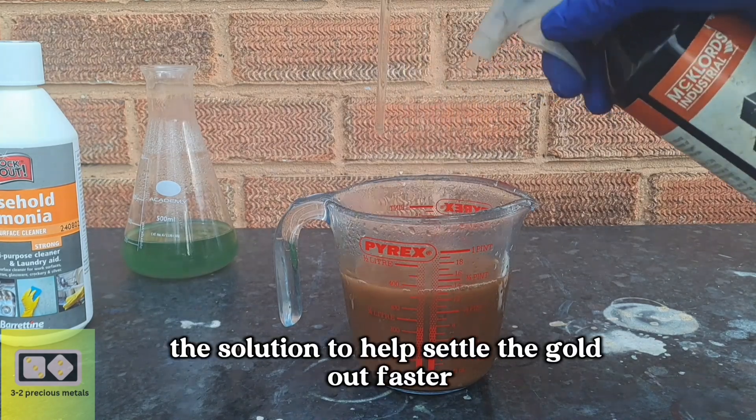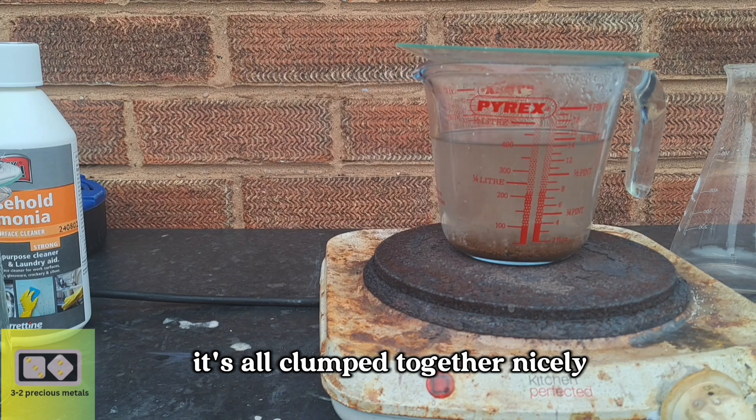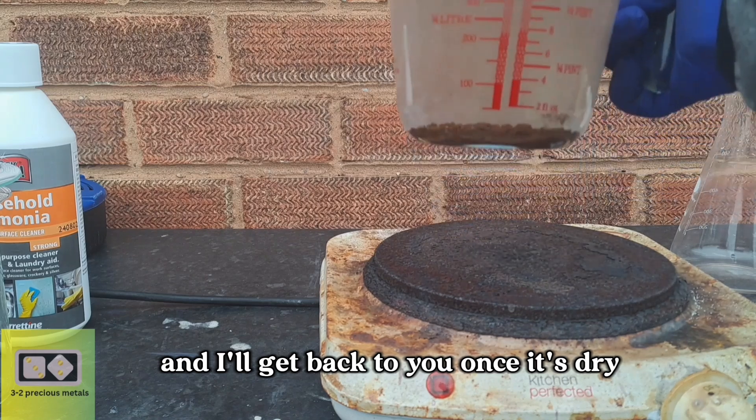I'll boil the solution to help settle the gold out faster. The gold is looking beautiful — it's all clumped together nicely and it's a uniform color. I'll repeat the whole wash process again off camera, and I'll get back to you once it's dry.